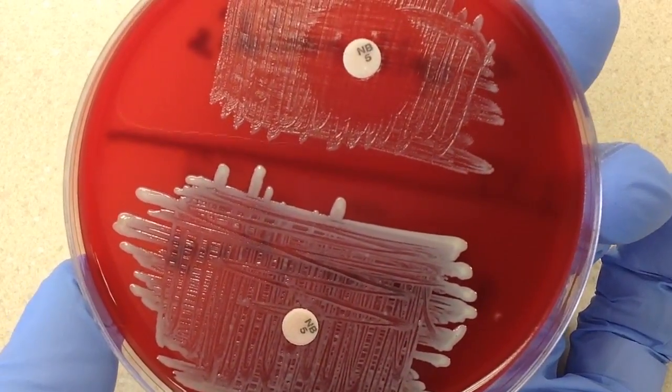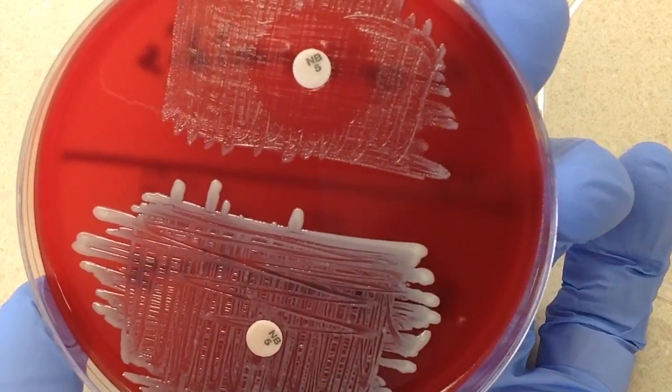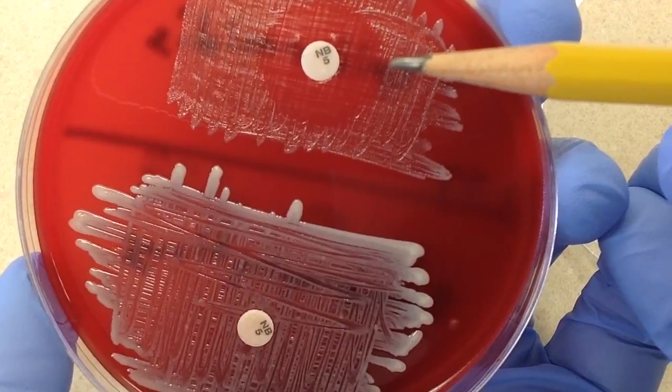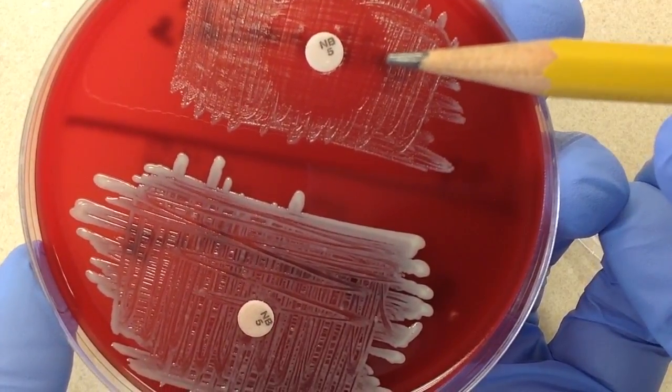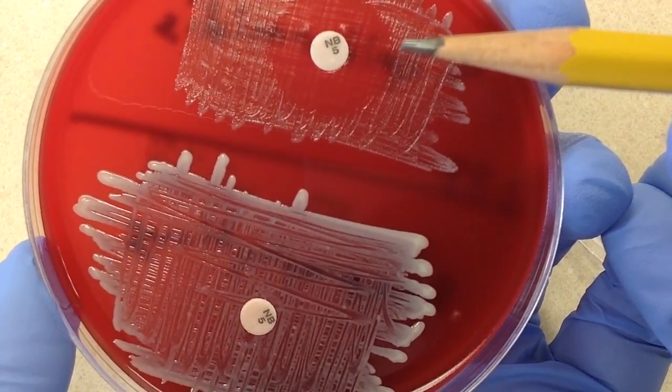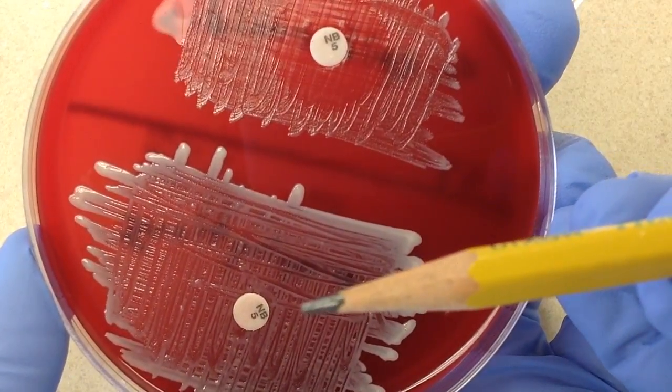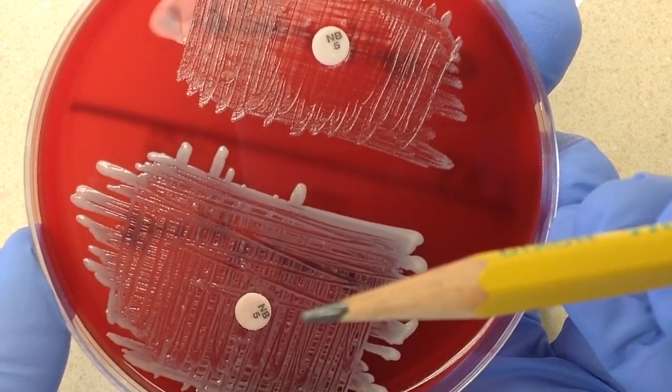So now it's time to go ahead and read these plates. We can see the obvious zone of inhibition or susceptibility on the top — this is Staph epidermidis. And on the bottom, we can see that it is completely resistant.